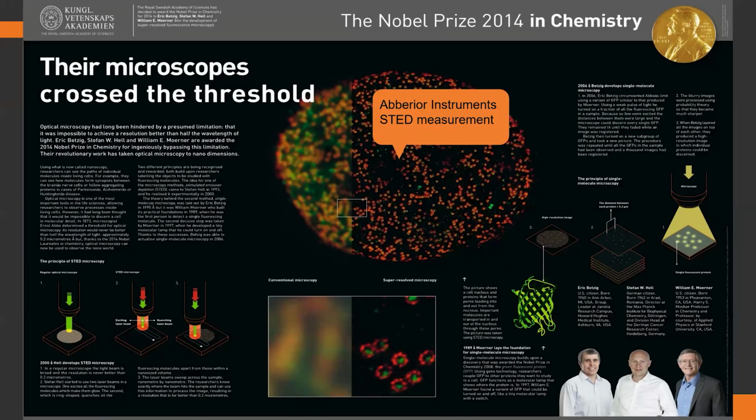That year's Nobel Prize was awarded to 2 technologies. One is STED microscopy, which is based on scanning microscopy, for example, confocal. Another technology is the single molecule localization based method, for example, PALM, STORM, or some other names, right?